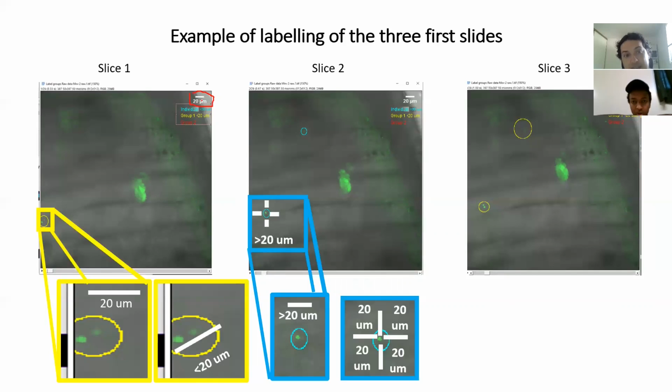Yeah, so here is 20 micrometers. And when you make a movie, the microscope will give you that information. Good. So I just recorded, and I am going to send a file that says scale bar. I'm going to show you later how to make a scale bar. But the idea is that if this is 20 micrometers, you can make a line in ImageJ and drag the line. For example, here, this is 20 micrometers.